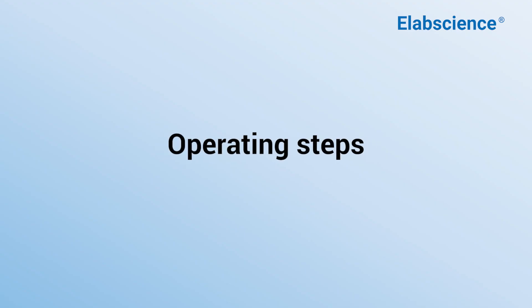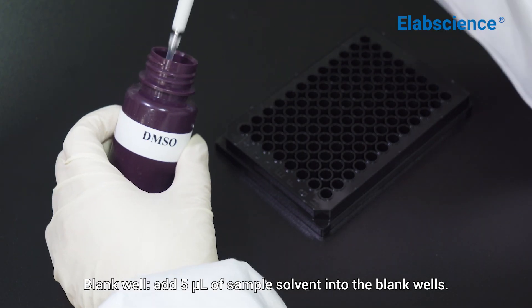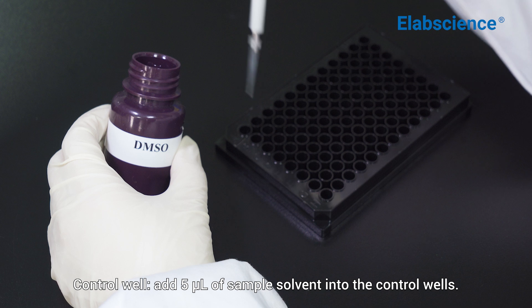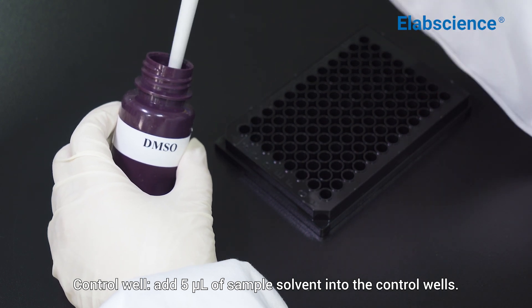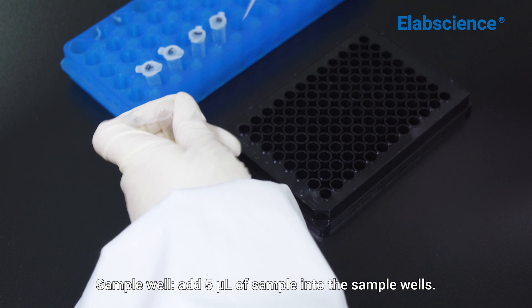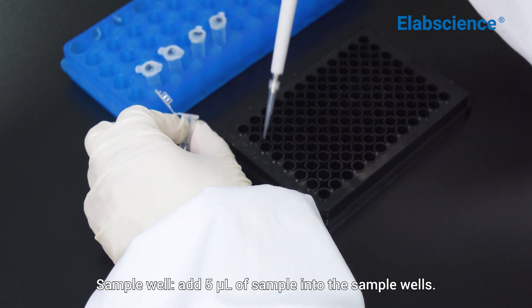Operating steps. Blank well: add 5 microliters of sample solvent into the blank wells. Control well: add 5 microliters of sample solvent into the control wells. Sample well: add 5 microliters of sample into the sample wells.